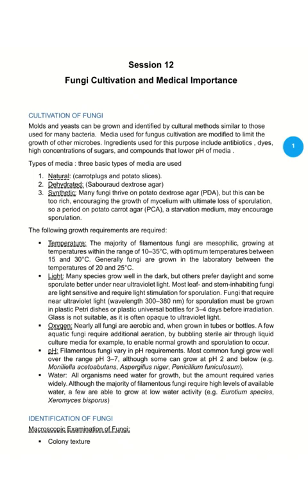Good day, students. Today is our 12th session. The title of the session is Fungi Cultivation and Medical Importance. So, we are going to speak about how to culture fungi in the laboratory.